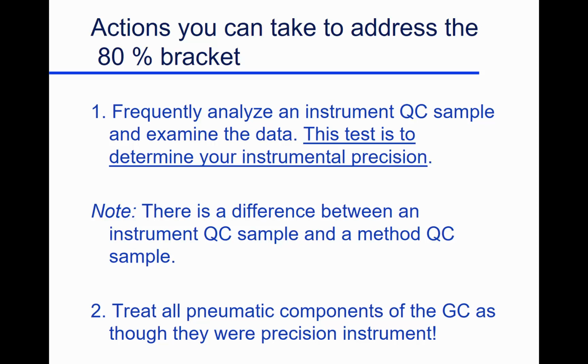Did it start when it should? Did it quit measuring the peak when it should? Sometimes there may be two compounds very close together. What did it do with them? Did it really go ahead and project? It tells you right on the screen what it did when it started and stopped measuring. Did it make the right decisions?